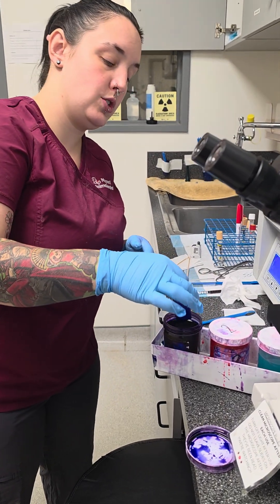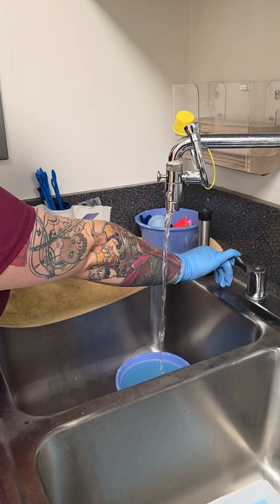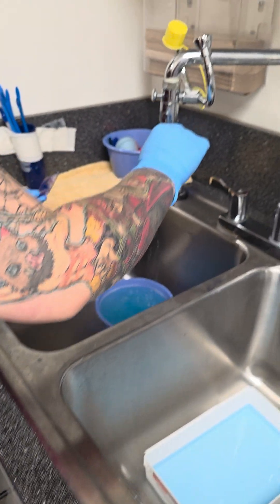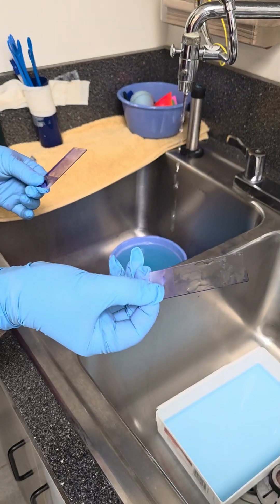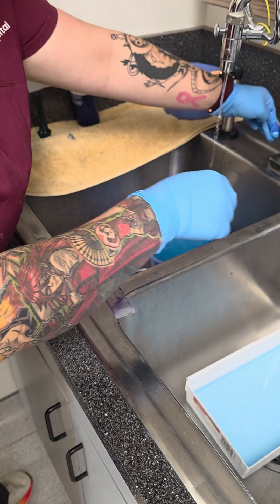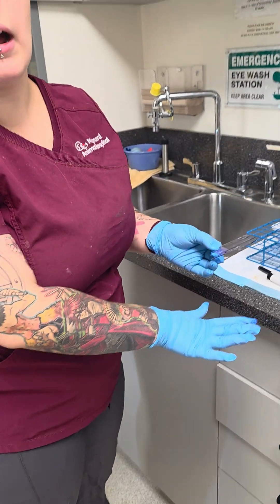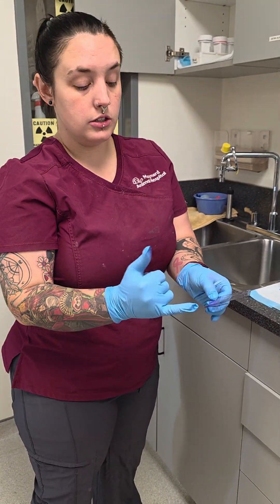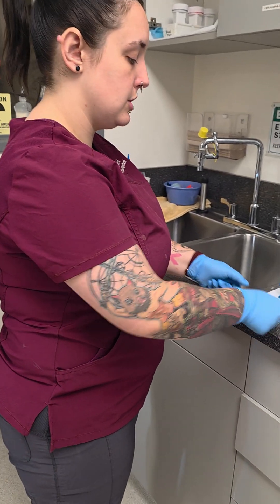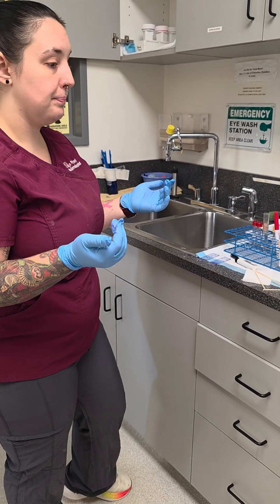All right. So now we have these, then we're going to take our water, put it on just a trickle, and lightly clean off the stuff. Then we let them dry. If you're going to stick them in the bibulose paper, do not press down, because anything that's glued on here is going to stick to that, and then it's not going to be a viable cytology. So if you have the time to just let them dry, that's fine. You can stick them in the bibulose paper and leave them to dry as well, but don't press it.